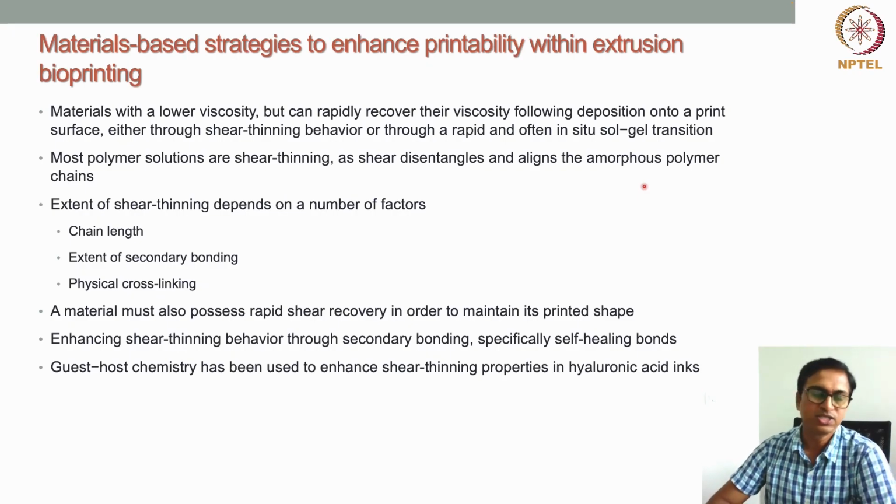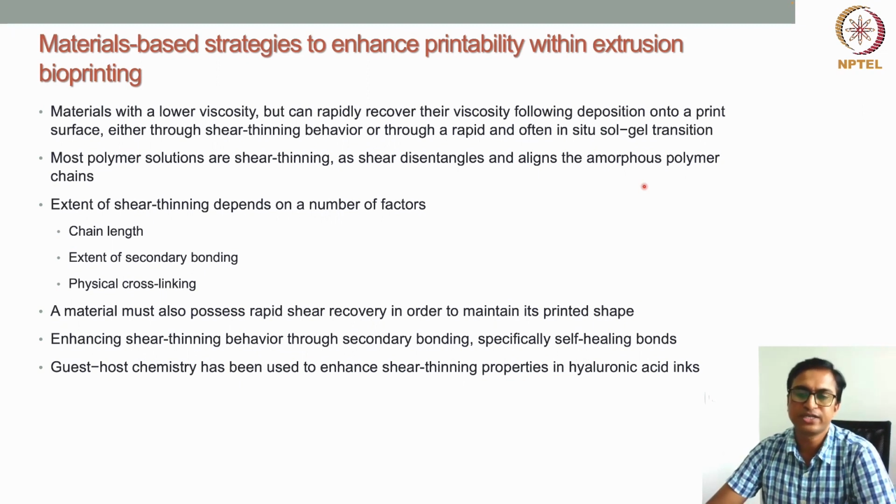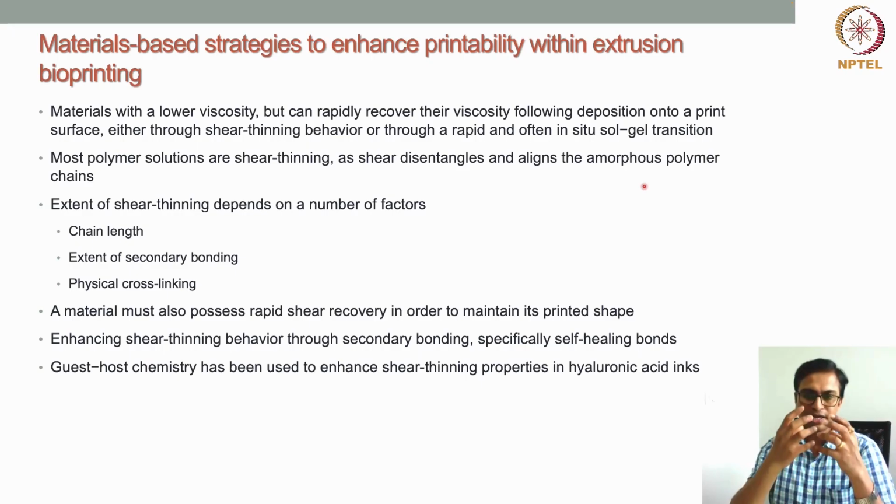The material must also possess rapid shear recovery in order to maintain its printed shape. That means that during extrusion the material viscosity comes down.